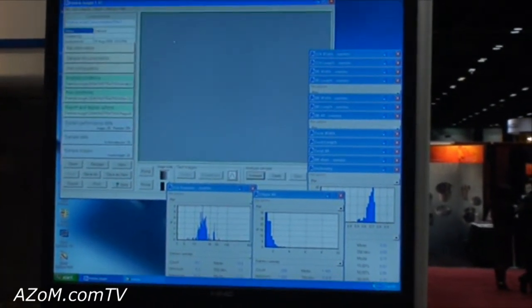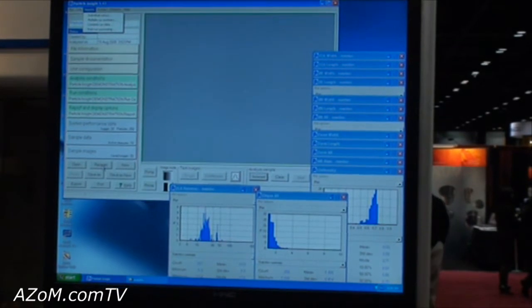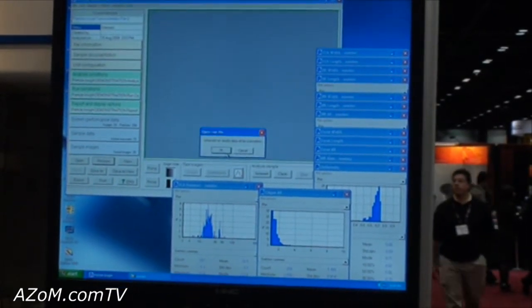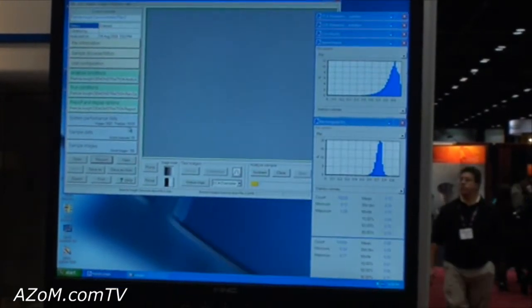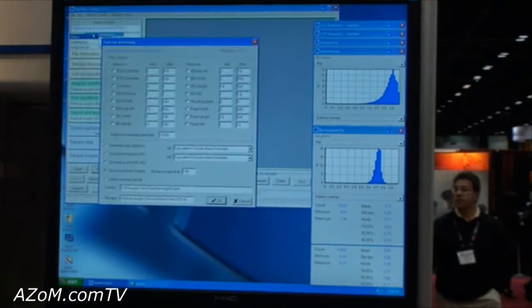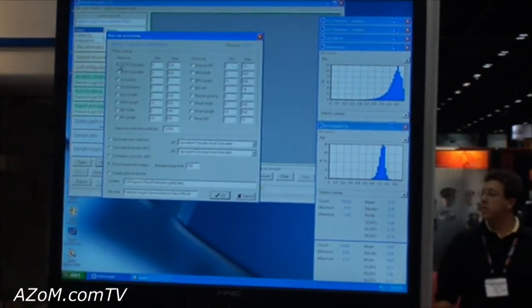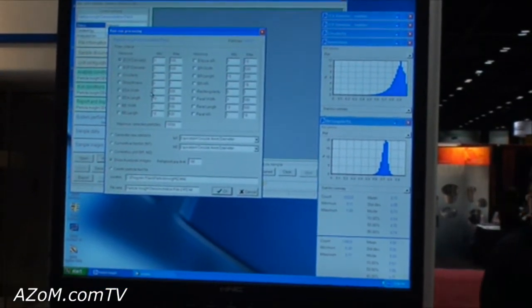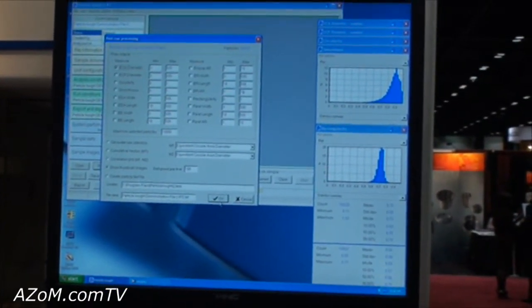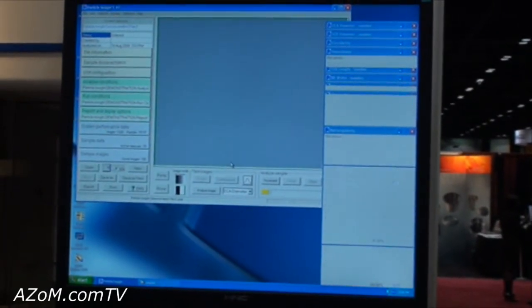One of the nice things about it, you can go in and reopen a file — let's use one that had 15,000 particles. You can go in and basically sort on any of the particles you want to see and show them all with thumbnails.